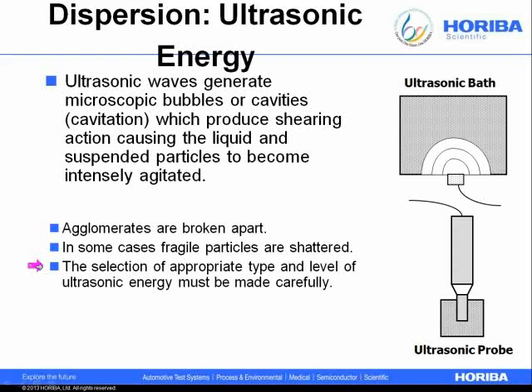Now, one thing you might notice as you use ultrasound is it heats the liquid up. So if you're really putting a lot of energy into a sample, you might want to put it in an ice bath before you put your ultrasonic probe into your sample in order to take away the heat, because the ultrasound, which is really energy, is being converted to heat in your sample, and that may not be good for the sample.